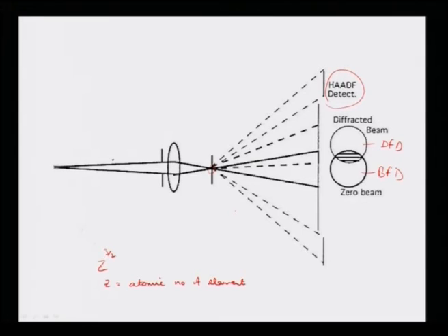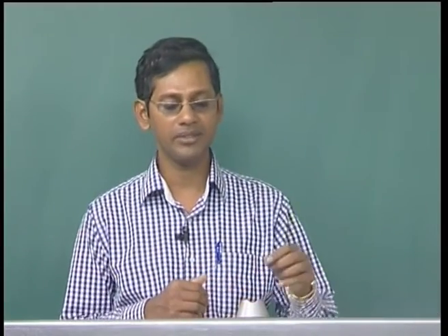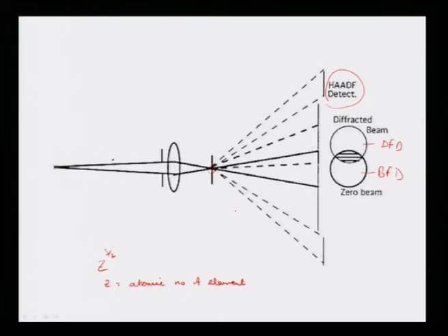If the sample thickness is high, the HAADF signals are very good; if the sample thickness is small, the HAADF signals are bad. So, that is why one needs to use a very high intensity beam as the incident beam on the sample, which is to be focused by the objective lens very properly, so that the intensities of the HAADF detector for the thin regions of the sample can be comparable.